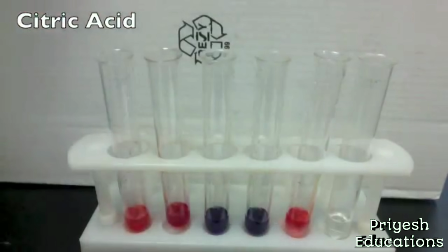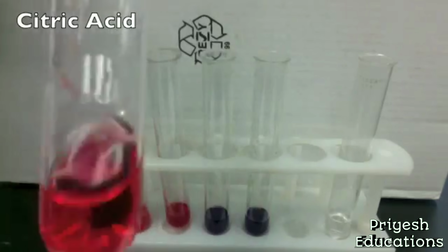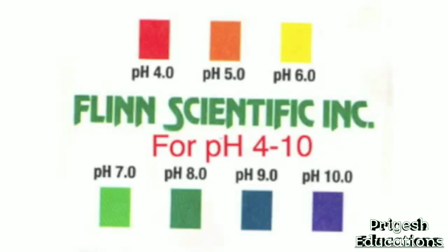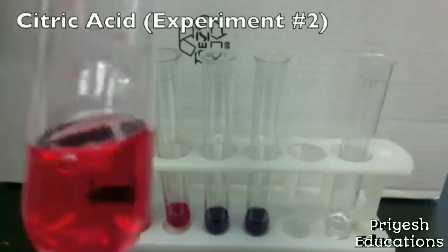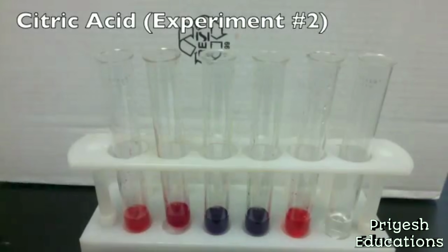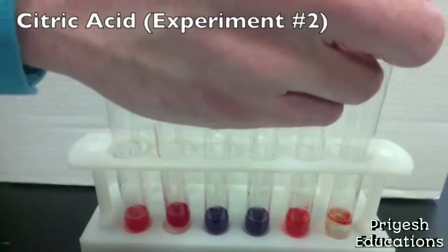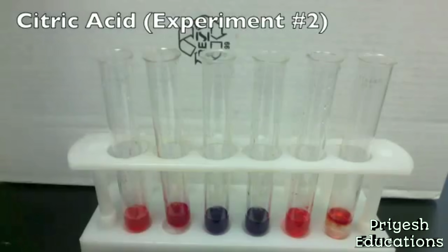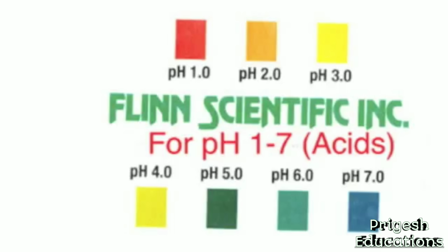While testing citric acid, we can see that universal indicator solution pH 4 to 10 turns red. That corresponds on our chart to a pH of 4 or lower. So we need to do further testing to figure out if it's a 4, 3, 2, or 1. By using universal indicator solution for pH 1 to 7, we can see that the citric acid turns orange. And on our chart, orange corresponds to a pH of 2.